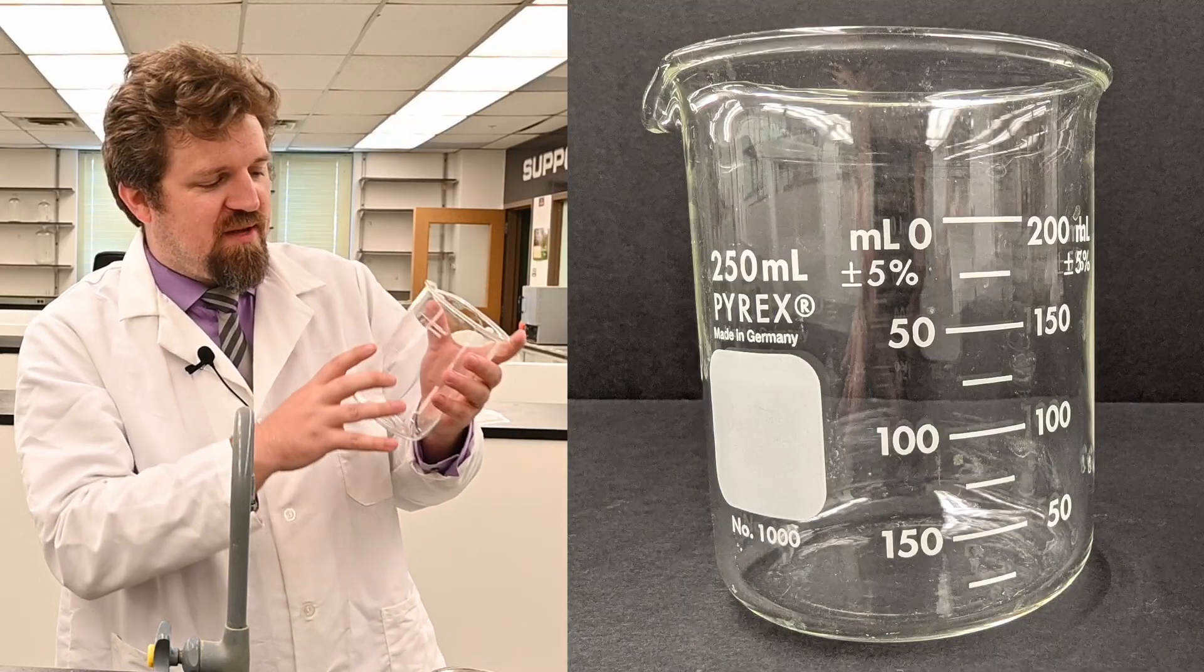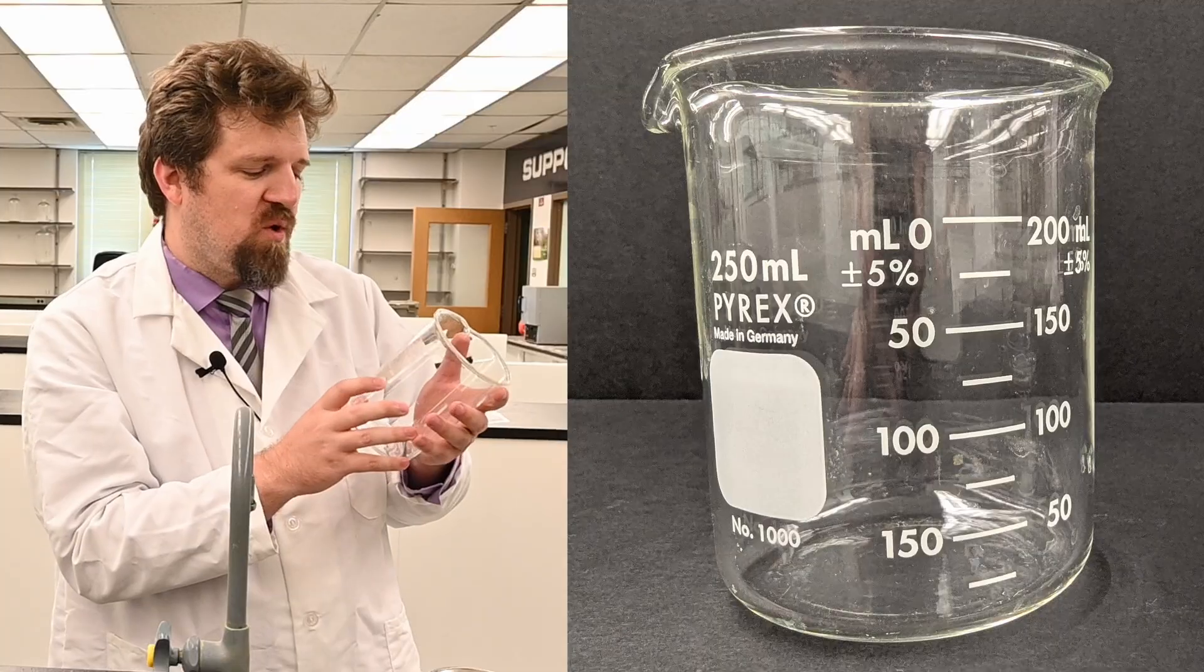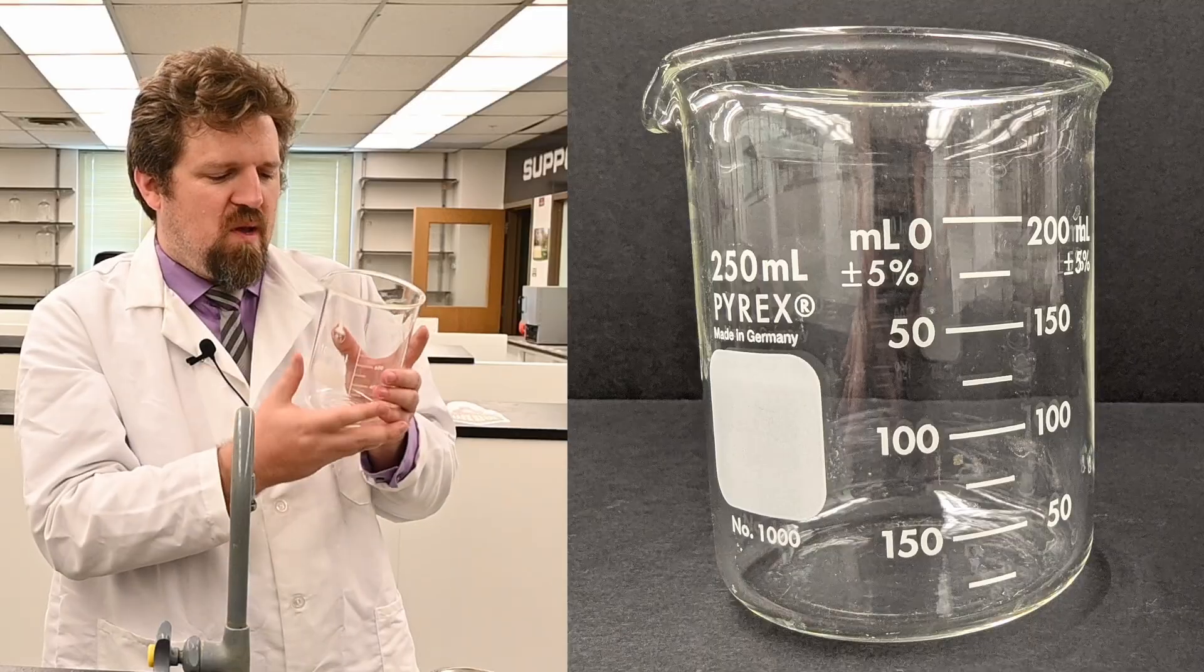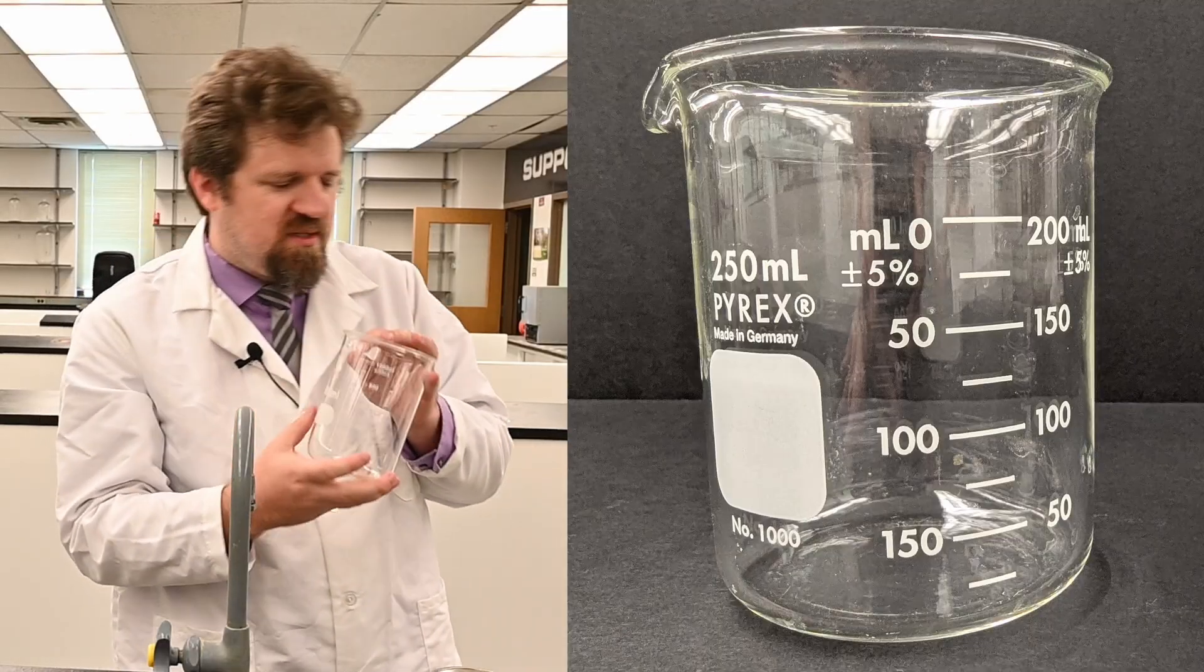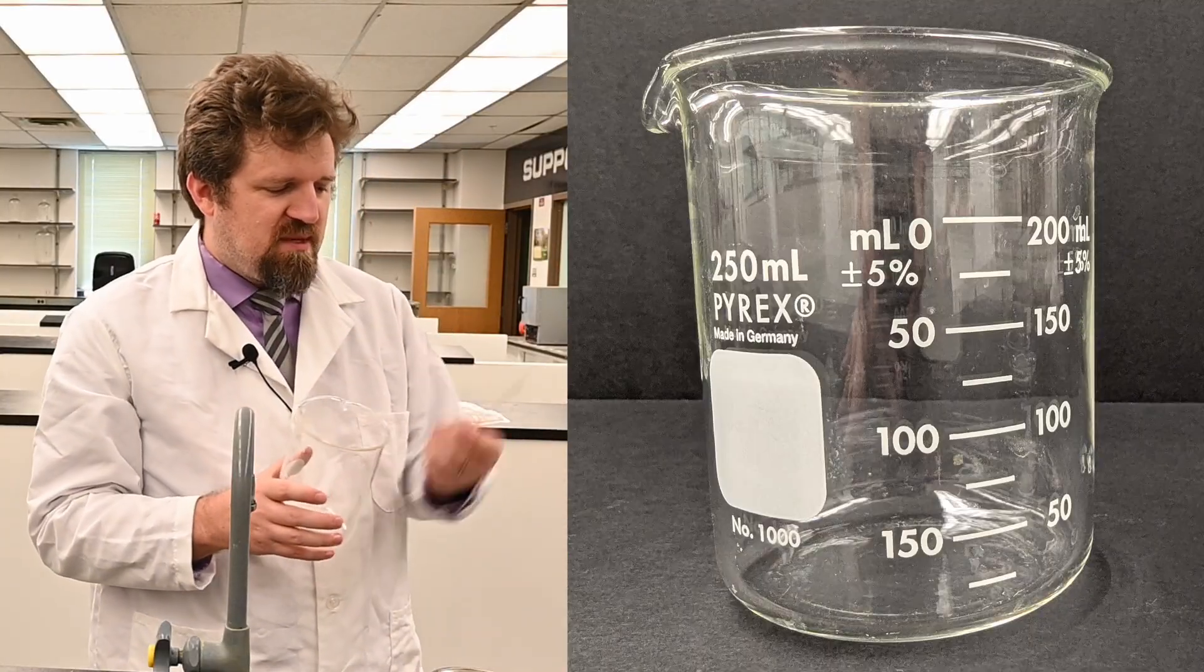This is the beaker. I feel like this is like the most basic type, like a cup of glassware you'll find in a lab. It has a nice little pour spout on it that allows liquids to flow out of it, though sometimes not very well.